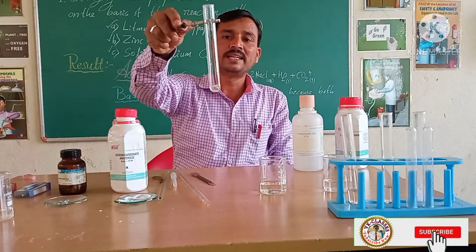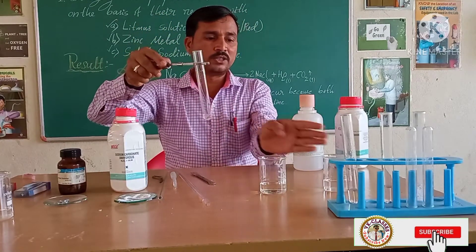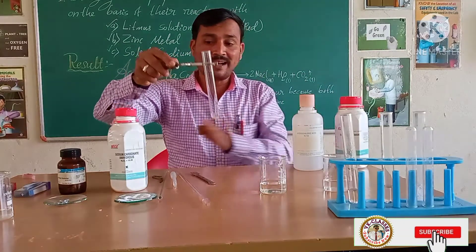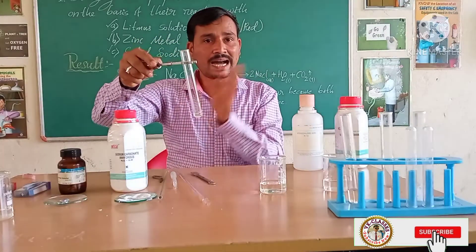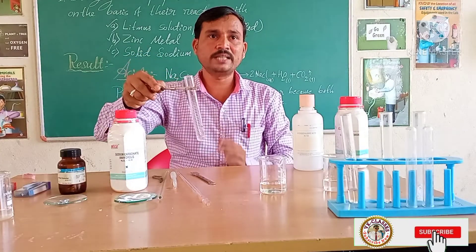Observe here — any reaction occurring in this test tube? See here, students: no reaction occurred because the solid sodium carbonate settled at the bottom and the sodium hydroxide solution remains as it is. No reaction occurs because sodium hydroxide is a basic solution and solid sodium carbonate is also a member of the base family — both are alkaline, hence no reaction takes place.